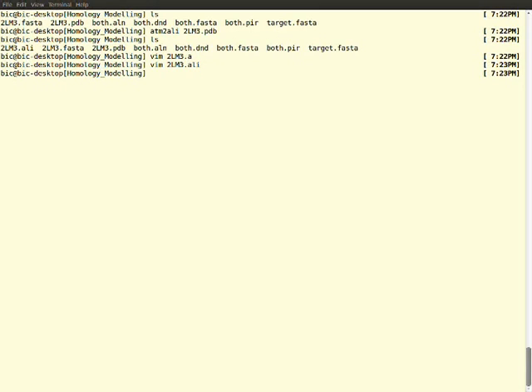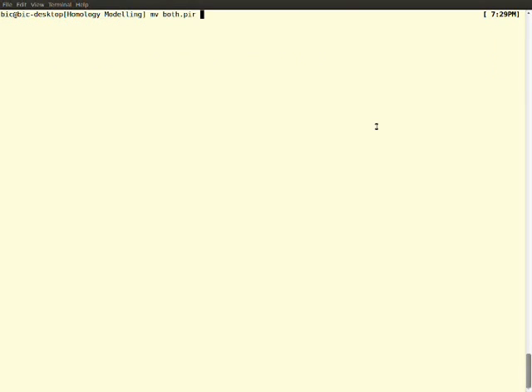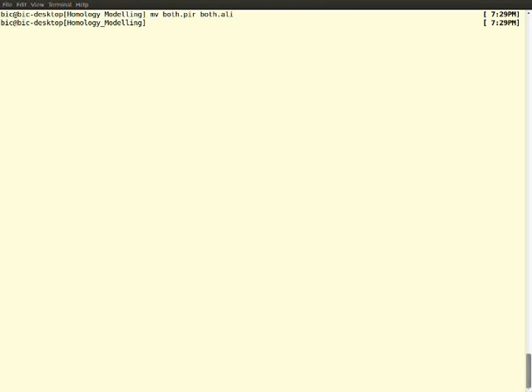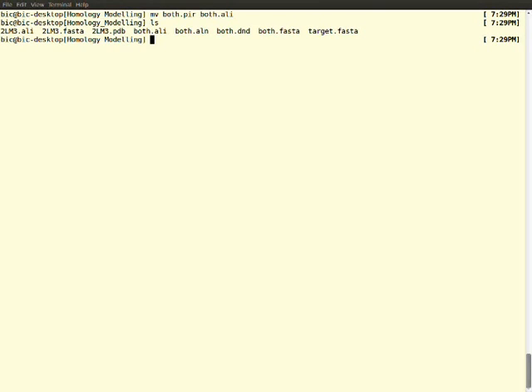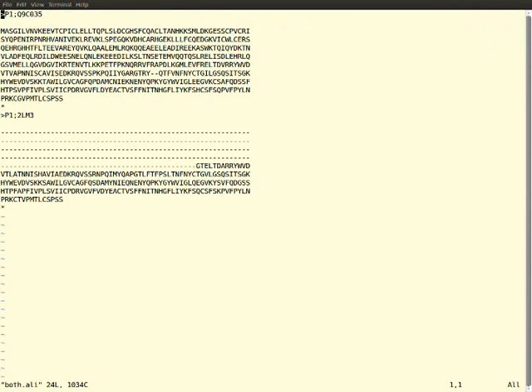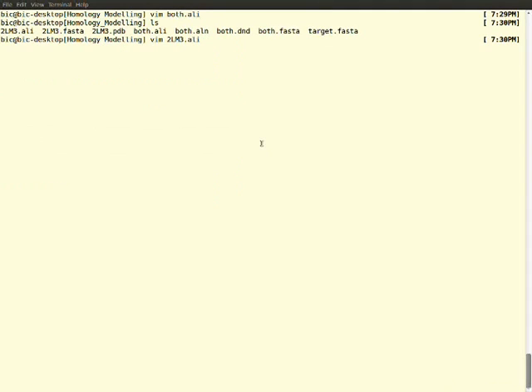We are converting the ATOM files into an alignment file. One more file has been added to my folder called 2LM3.ALI. If you use that ALI file, you can get the format - all the ATOM files have been made into one alignment format. The two things to be noted in alignment format are the star and the P1, and colon-separated description about that protein. We want to edit the 2LM3.ALI using that ALI format as reference. We want to convert the PIR format for both sequence and structure, means target and template.